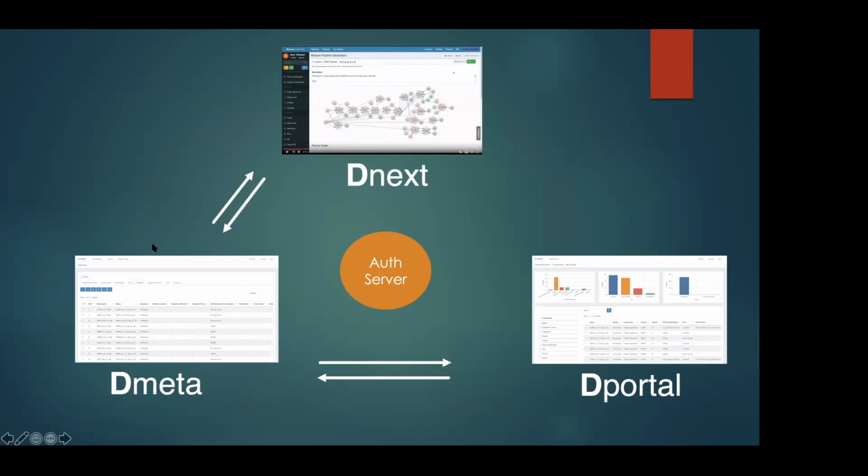They enter the data and send you all the data to UMass. Then when they're entered here, you get the information, start doing your libraries, prepare them, and then send them to the sequencing facility, where they sequence. So every single step will be updated here. And then when the sequence comes back from the sequencing facility, when you enter that information into Dolphin Meta, it sends all that information to DolphinNext, processes the data there and sends the results back.